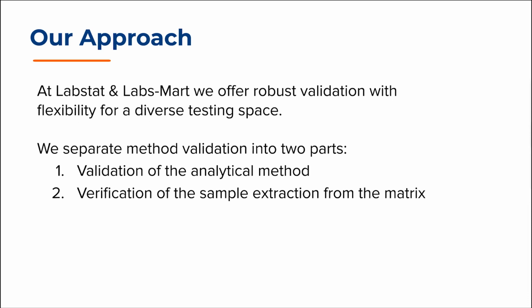Okay, so we've gone through all the required elements in a validation. Now I'd like to speak briefly about how we approach validation here at Labs-Mart. It's important to recognize that a single analytical method cannot be developed to separate an analyte of interest in every possible matrix. To account for the highly variable nature of different matrices, we have employed a two-stage approach to our validations. We call it the validate and verify approach.